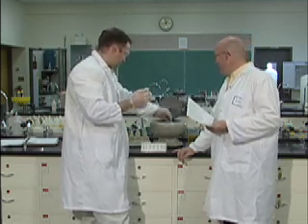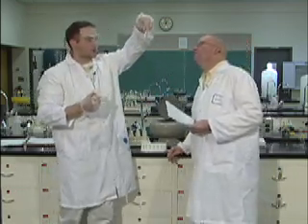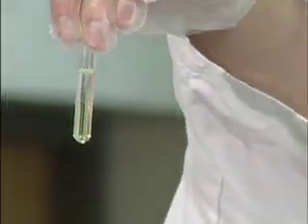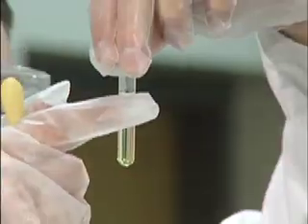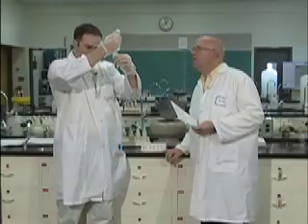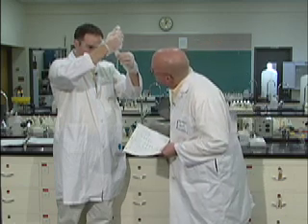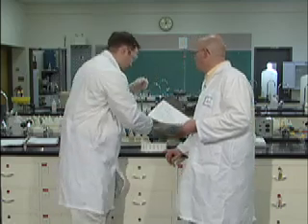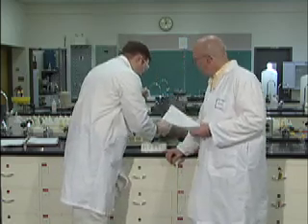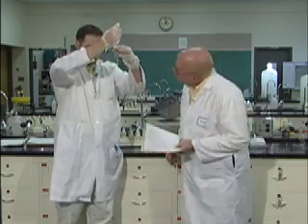So, now you'll notice that sometimes when you stop this centrifuge, the solid comes up here. It gathers at places. Now, what we're going to do here is try to decant the fluid, but leave the solid. That could be tough. You need a surgeon's mind. So you're getting all the yellow stuff out. I am, and I'm just leaving the solid precipitate in the bottom.